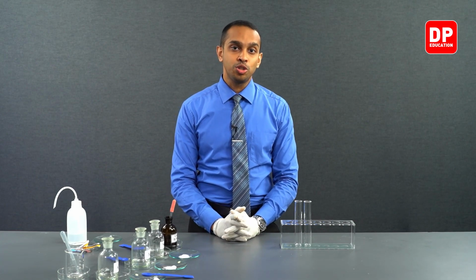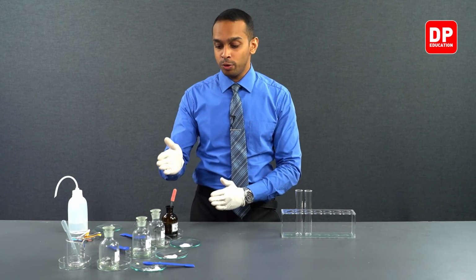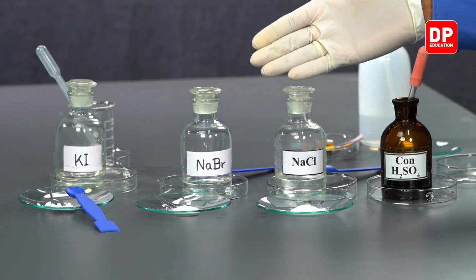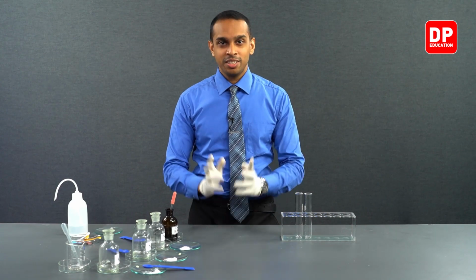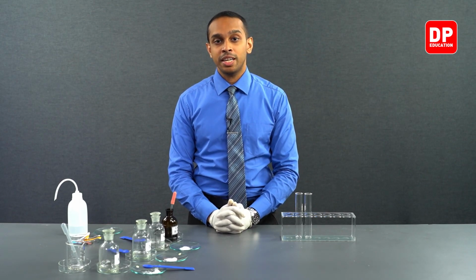Normally, it is not advisable to have a lot of gases roaming around in a lab atmosphere. So we had to remove the sample that we did the experiment with in order to make sure the space where we do these experiments is kept safe. In the future also, when we do the experiments for sodium bromide and sodium chloride, we will be removing those samples right after the practical is done, just to make sure the lab environment here is kept safe.